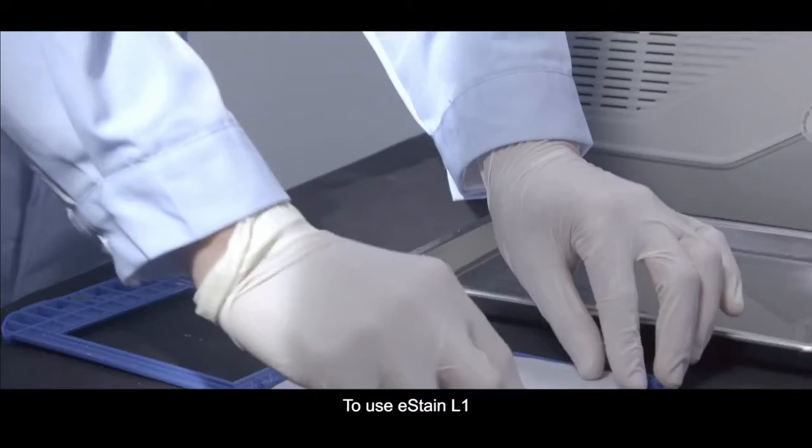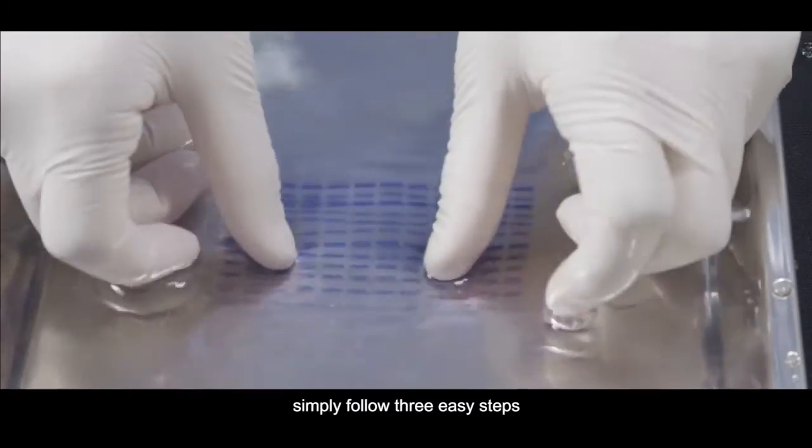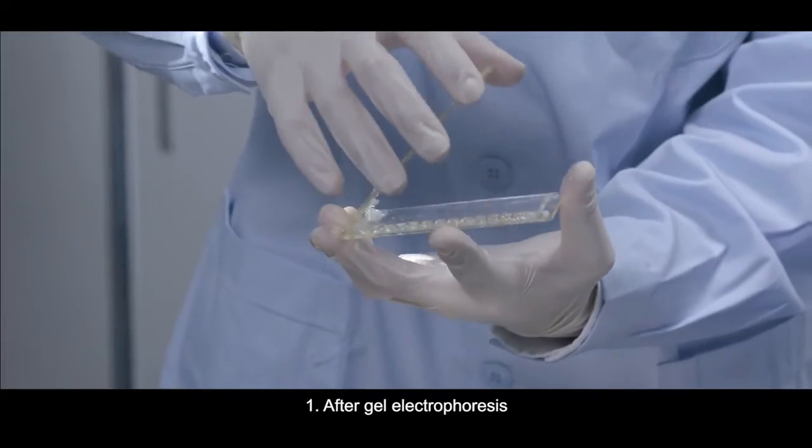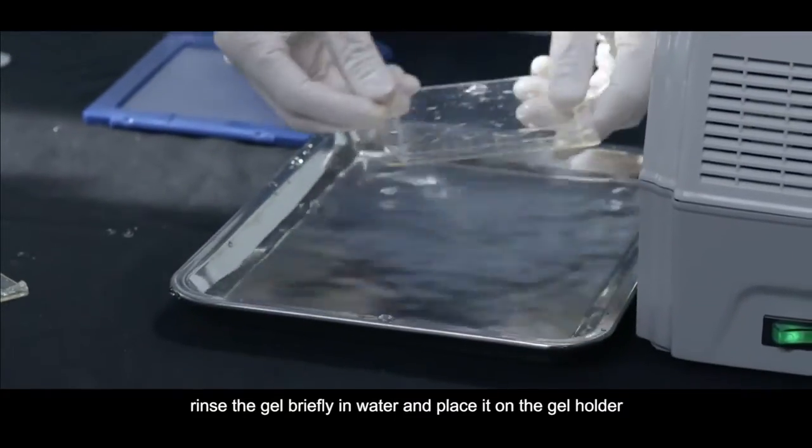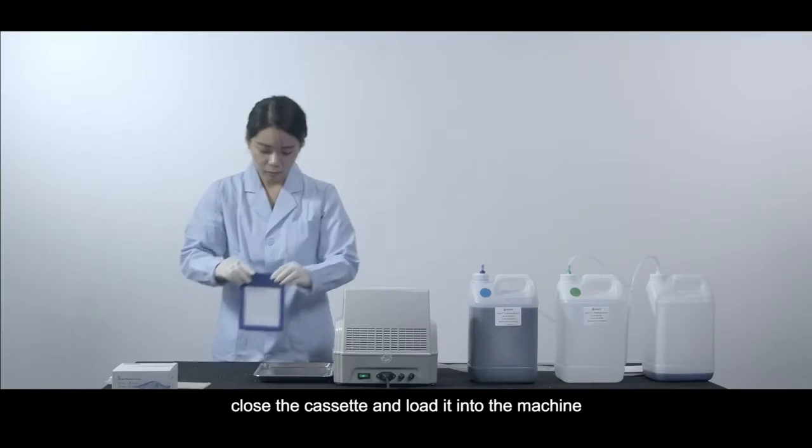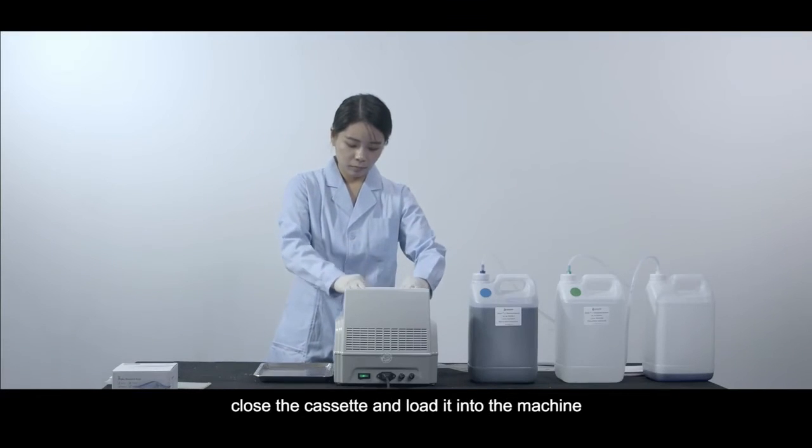To use eStain L1, simply follow three easy steps. First, after gel electrophoresis, rinse the gel briefly in water and place it on the gel holder. Add a pre-wet filter paper onto the gel, close the cassette and load it into the machine.